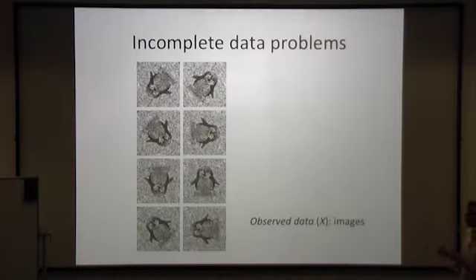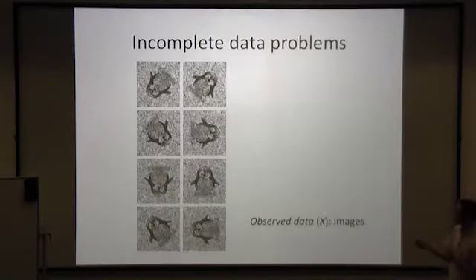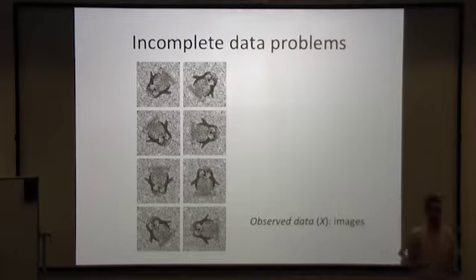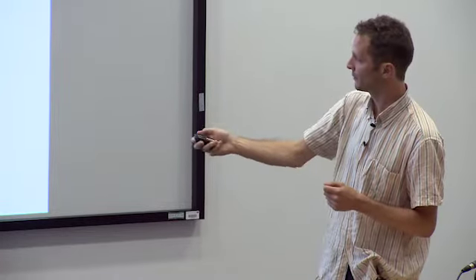Now, let's forget 3D Jan and so on and go to a much simpler test case to study alignment of images. These are now noisy images of a penguin. It's a two-dimensional signal we're after here, and they're all in different in-plane rotations. They're actually all nicely centered.